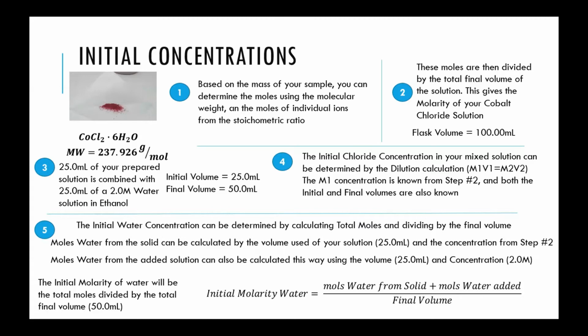But in order to determine those, you first need to know what you're working with. What is that starting amount? And this is how you would go about determining those initial concentrations of chloride and of water.